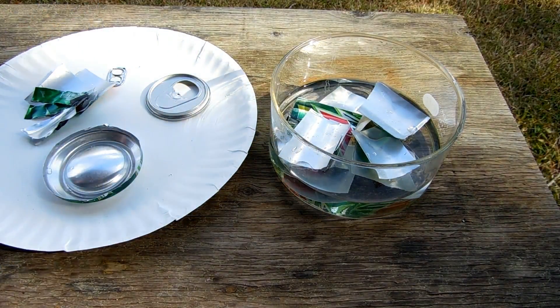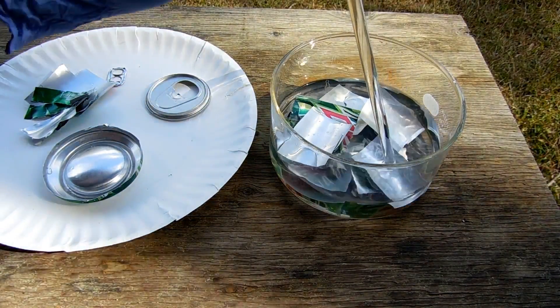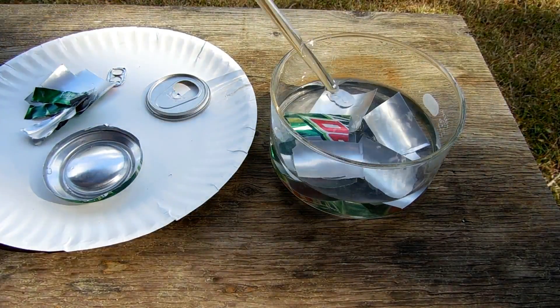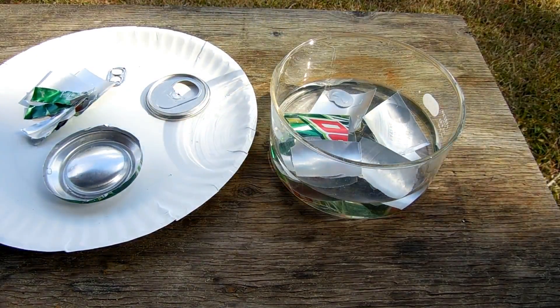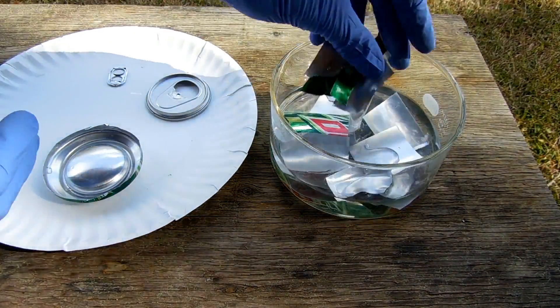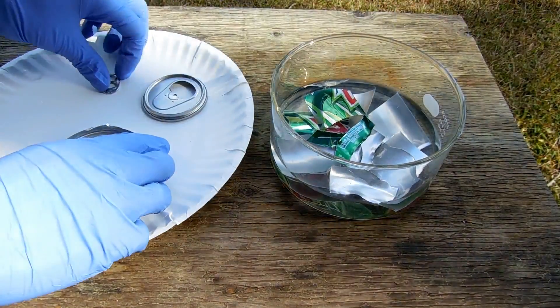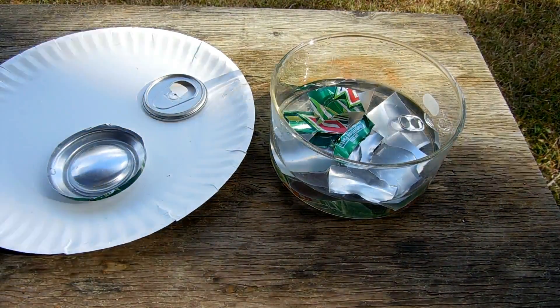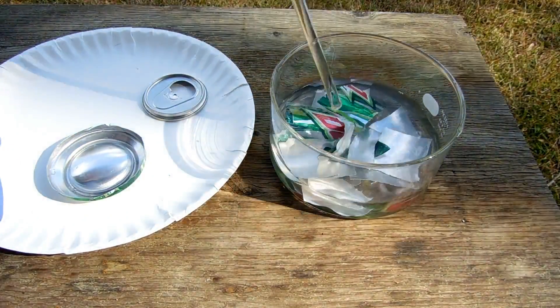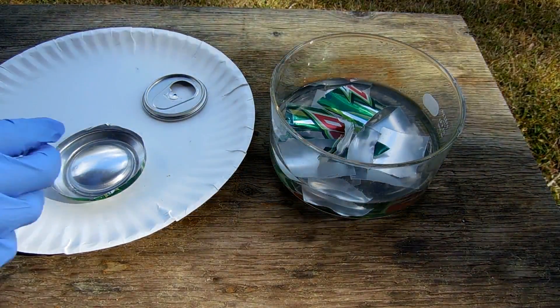The reason I'm doing this outside is because this produces hydrogen as one of the products. Hydrogen is not terribly dangerous unless it's confined, and then of course it's flammable. But anything that produces gases I like to do outside, because it always throws up little tiny droplets of the solution, and that can be irritating.